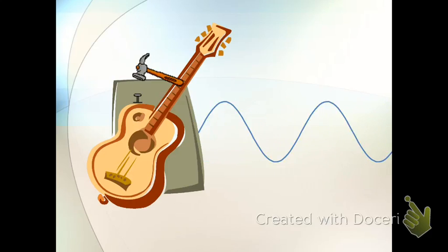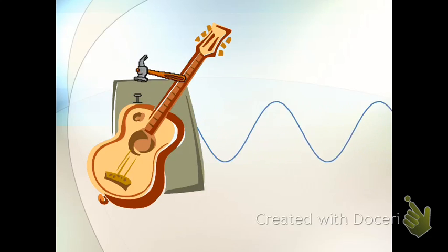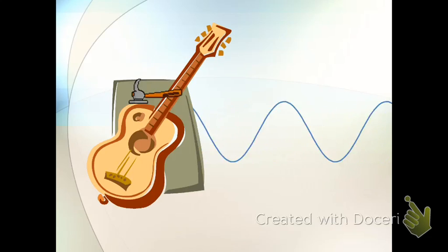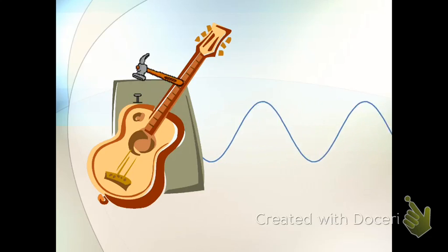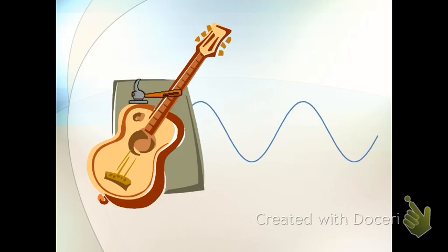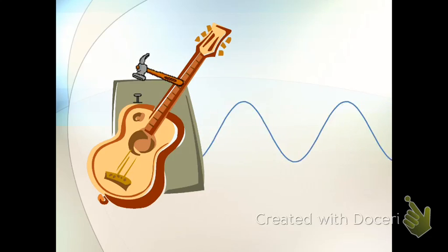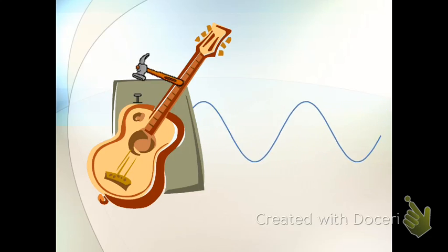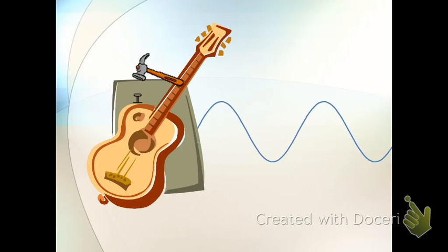Okay, so imagine you have a guitar, and the guitar represents a molecule. The molecule is in its chemical environment, and then we hit it with a large electromagnetic pulse. To illustrate an electromagnetic pulse, I used a hammer. When the hammer hits the guitar, noise is going to come out of the guitar. Initially, there's a lot of noise, but as time goes on, that noise dampens, and what you begin to hear is only the resonant frequencies of the molecule.